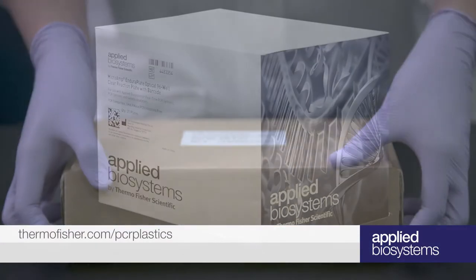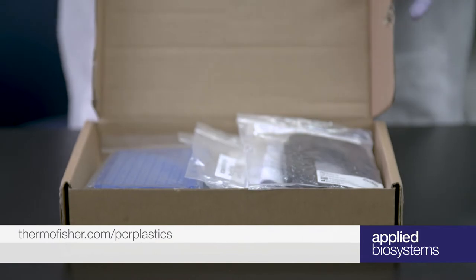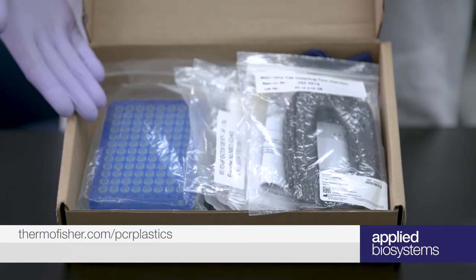These tools and accessories can be found in the PCR Starter Kit located in the Thermal Cycler box at the time of purchase.